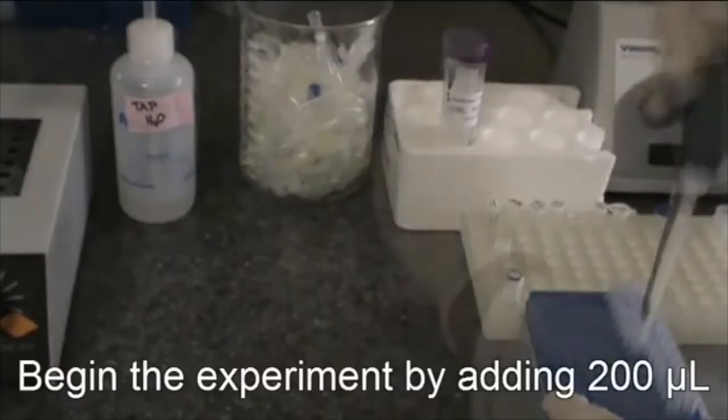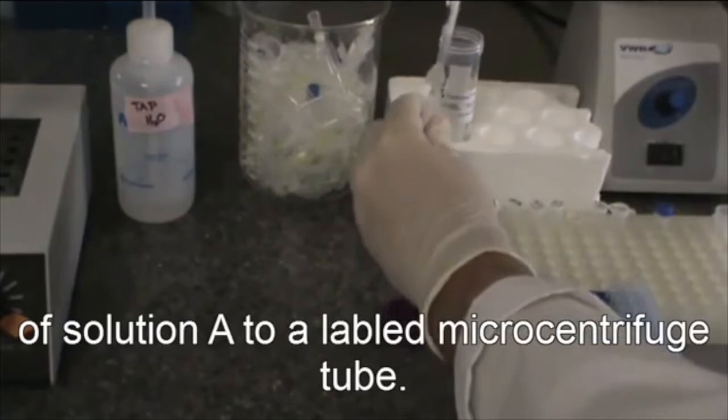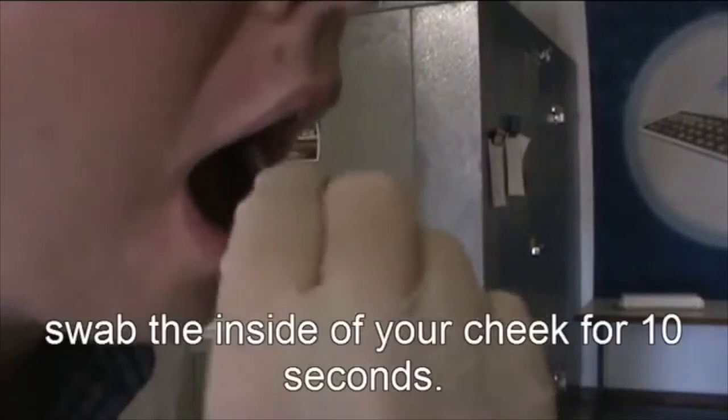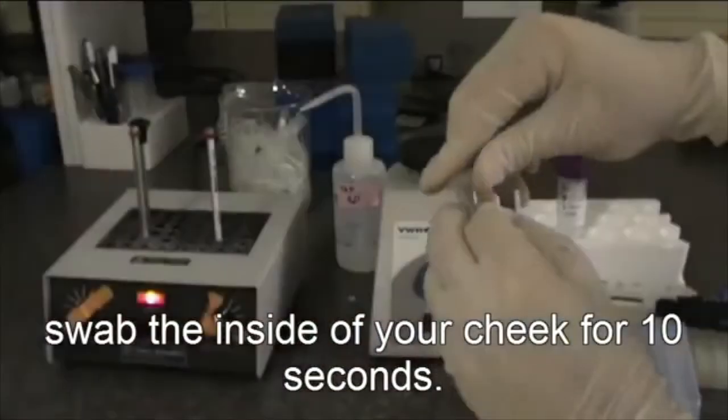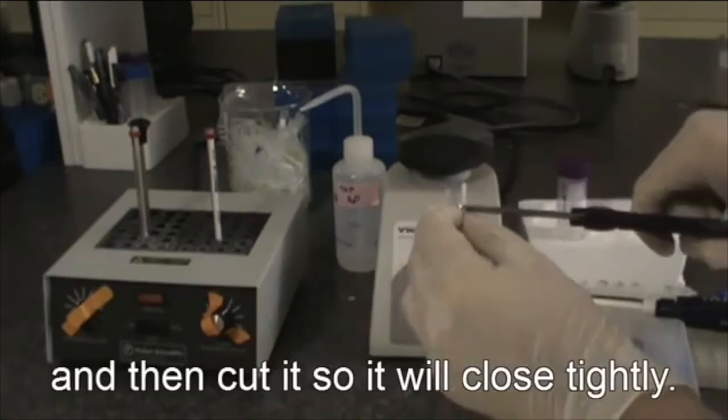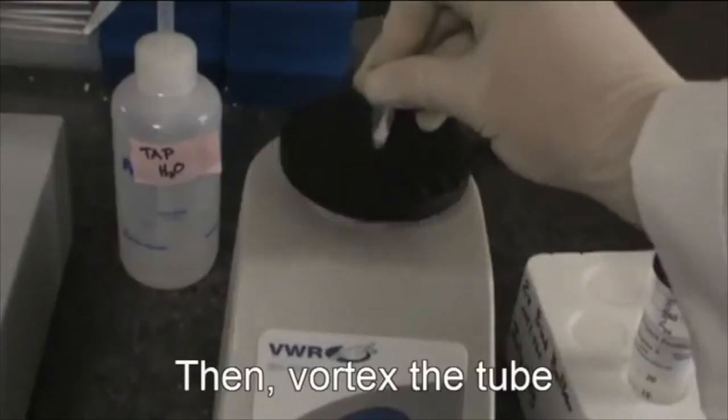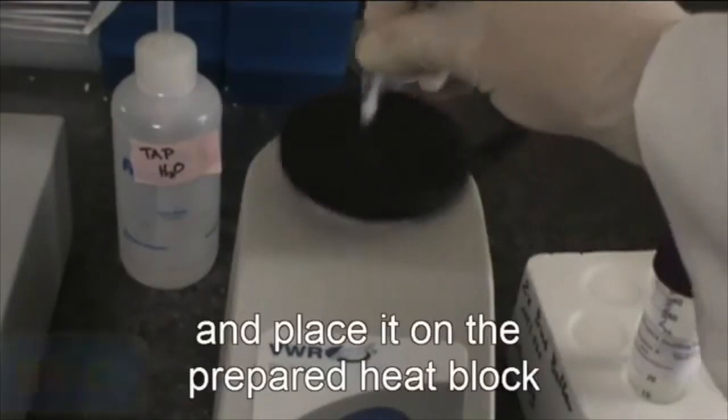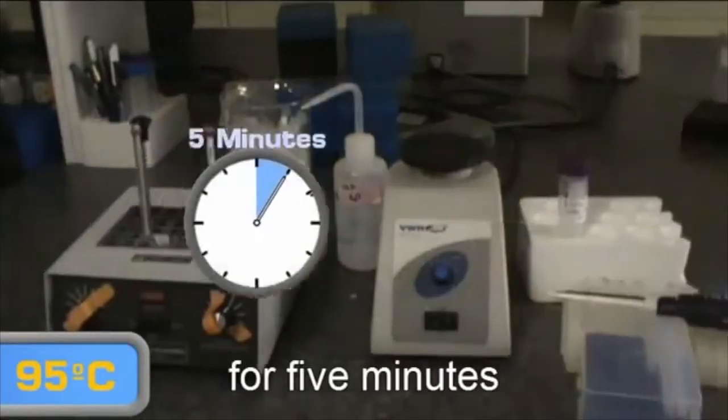Begin the experiment by adding 200 microliters of solution A to a labeled microcentrifuge tube. Then using the provided cotton swab, swab the inside of your cheek for 10 seconds. Place the cotton swab inside the tube and then cut it so it will close tightly. Then vortex the tube and place it on a prepared heat block for 5 minutes.